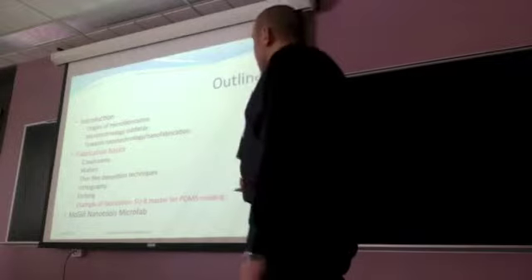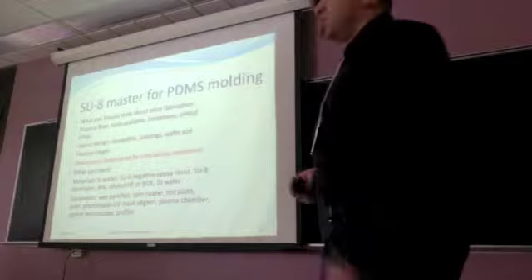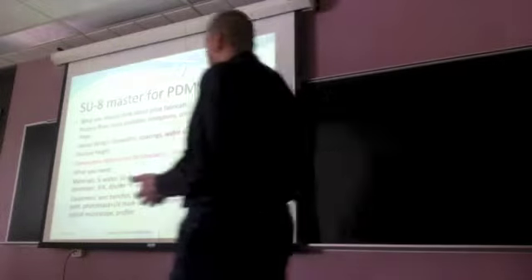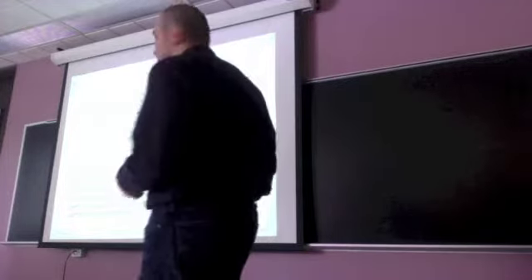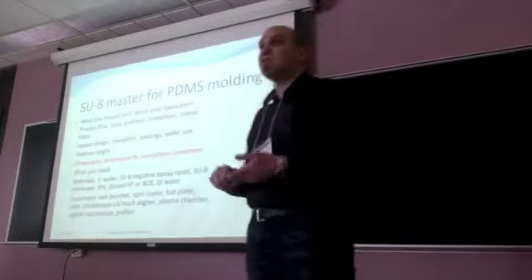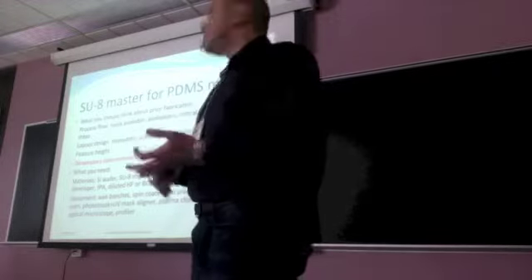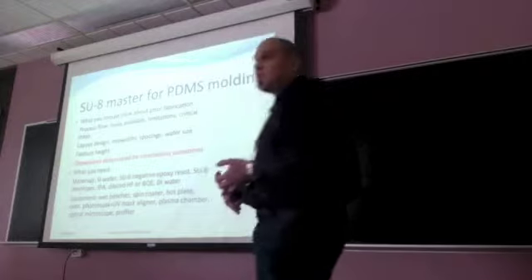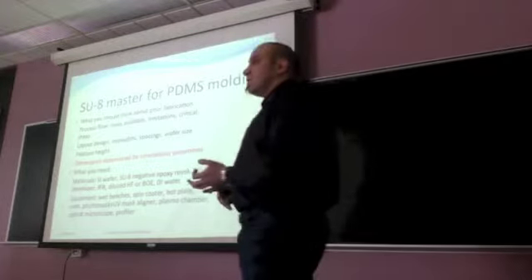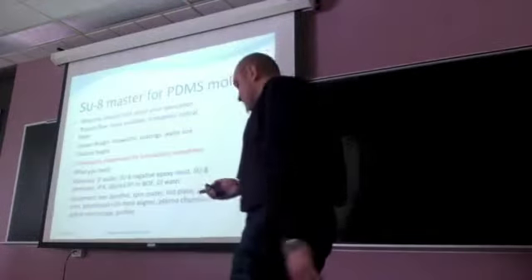So when you have a project, what you should think about before fabrication is the process flow. You need to know the techniques, you need to know the tools available in the fab, and you need to know the specification and limitation of these tools. After, you have to design the layout with your patterns and the dimensions. And sometimes the dimensions are determined by simulations.